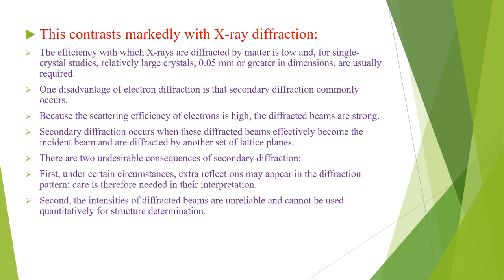One is that, under certain circumstances, extra reflections may appear in the diffraction pattern, and very great care is therefore needed in their interpretation.